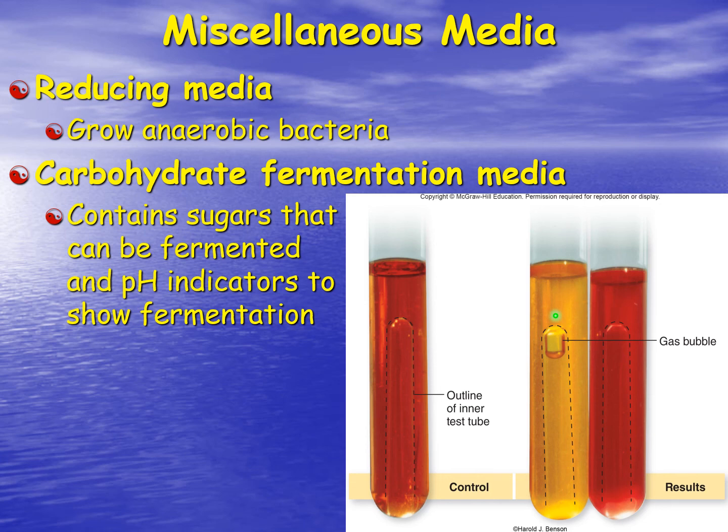This one, however, changed the pH, and we had a color change within the media. This shows that this particular bacteria used whatever sugar we put in here. And by the way, the Durham tube shows that this also produced a gas of some sort, and the little gas bubble gets trapped inside that inverted Durham tube.